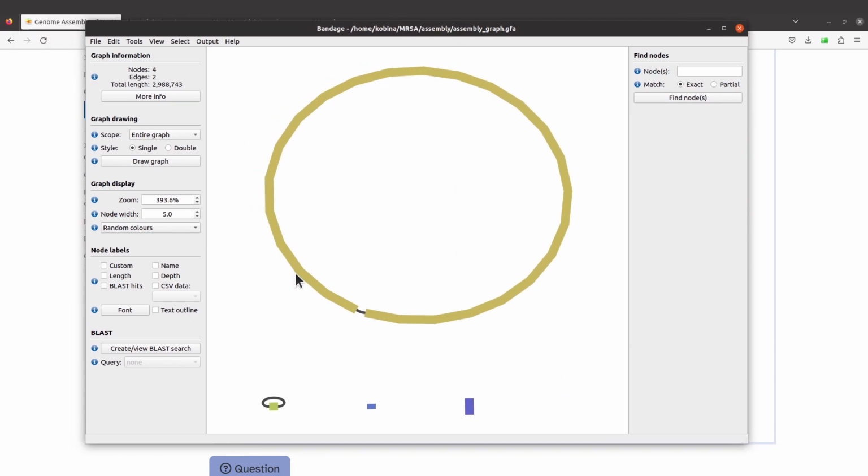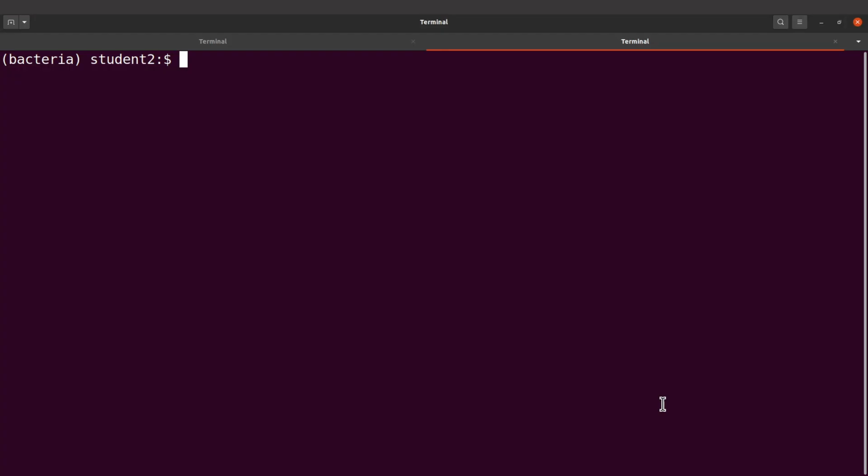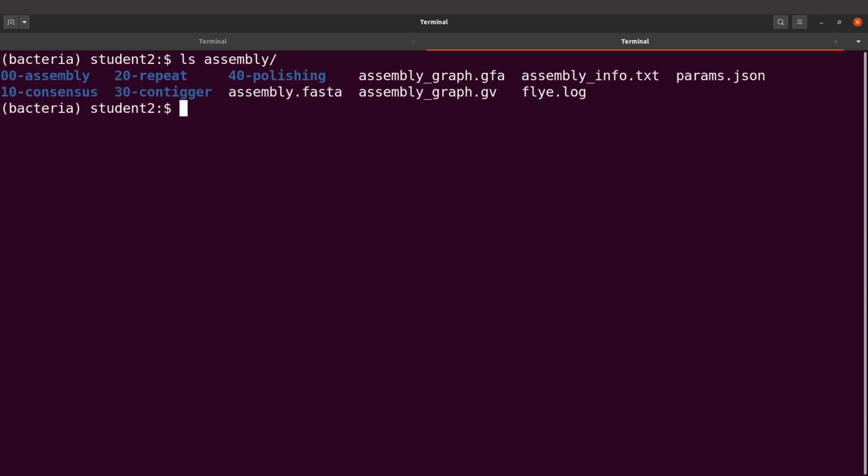I'll rather focus on this one for now. All right, so let's proceed. Let's do something. Remember when we displayed the assembly_info.txt, we had some information coming up. Let's just do that again. I'll do that here. So I'll just display it again.